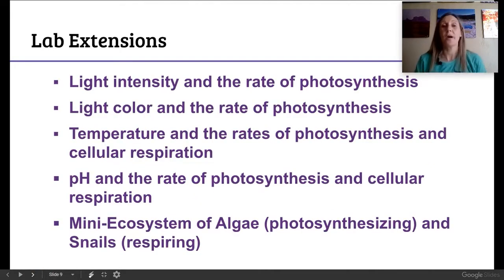As I mentioned before, a couple of things. The first part of the photosynthesis cellular respiration lab is a core lab, and it's just the kids. It's very simple. They have 2 cuvettes. One is put under the light, one is put under the dark, but they both start out with that fresh CO2 indicator solution that's at a neutral pH. And then they take measurements every 5 minutes to see how their samples are changing over about a 30-minute to 45-minute period, whatever works for you in your classroom and the time you have allotted.